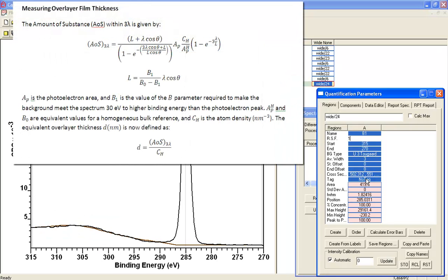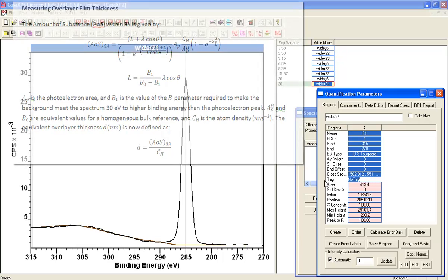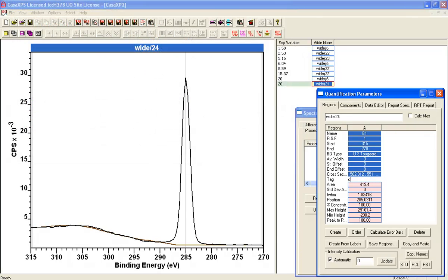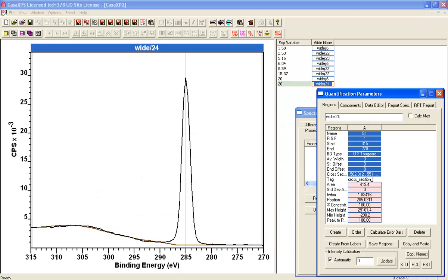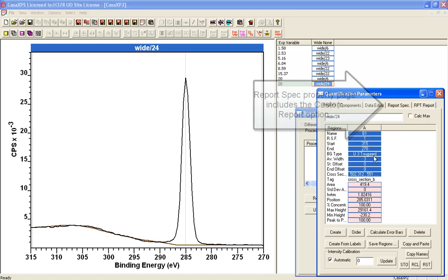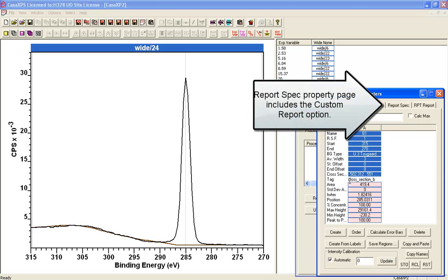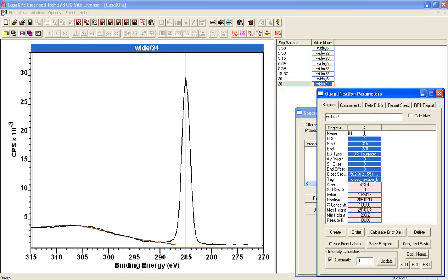So this is going to give me my B1 in the calculation. And in order to extract that B1 value, I need to specify using the tag field a key string which is cross_section_B. And that'll be crucial when I use the custom report to extract the B parameter when I do the reporting table. So I've called that B1.